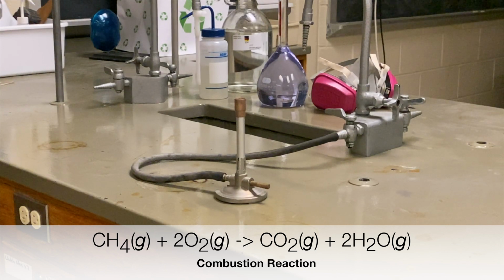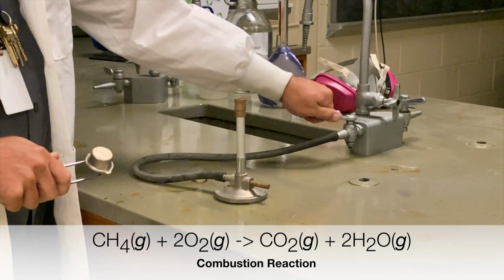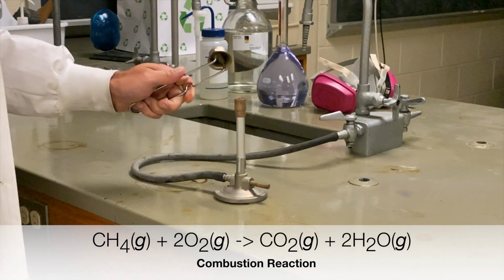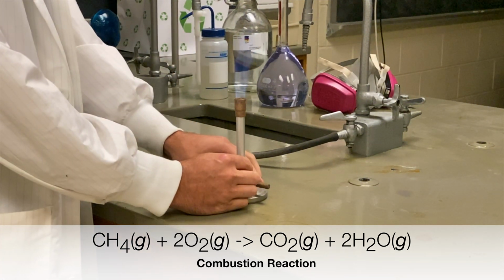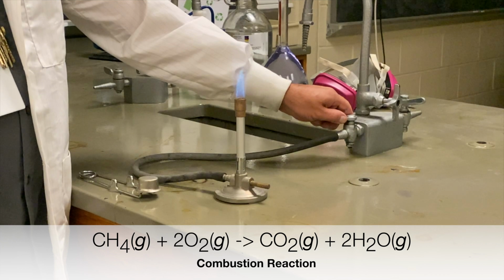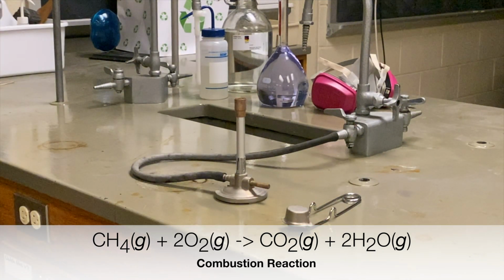In our last reaction type, the combustion reaction, we'll demonstrate the reaction between methane gas from our Bunsen burner and oxygen gas in the atmosphere. As we release methane gas, it reacts with the oxygen in the air when a spark is applied. We adjust the bottom of the Bunsen burner to adjust the flow of oxygen to get the right heat and temperature for the flame to be perfect.